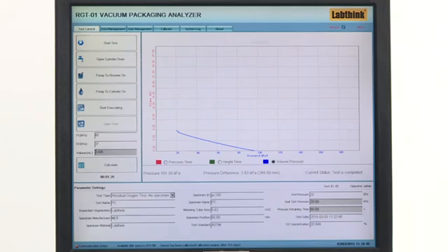Click to check volume pressure curve and determine a smooth and even section in the curve. Input P1 value as the initial point, that is, higher pressure value point. And input P2 value as the end point, that is, lower pressure value point. Click Calculate to obtain the test result.